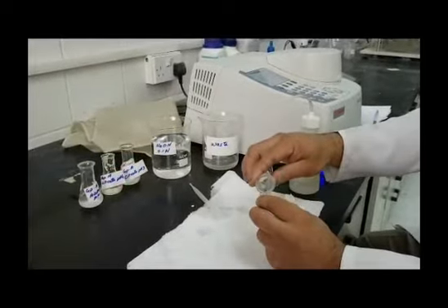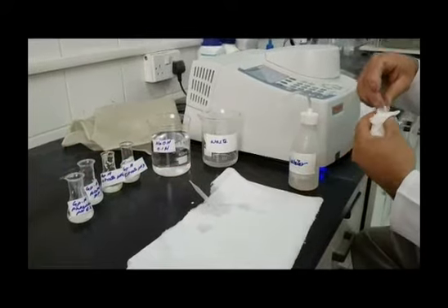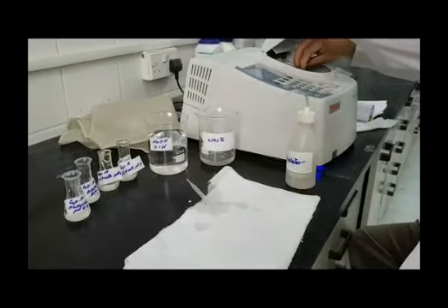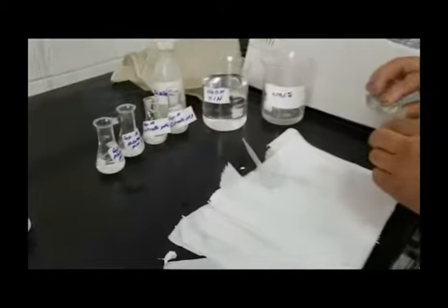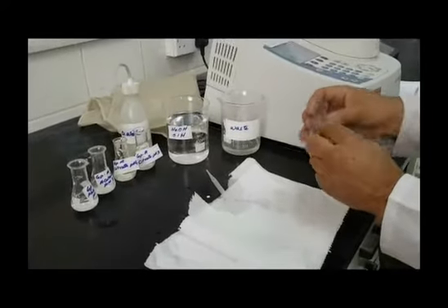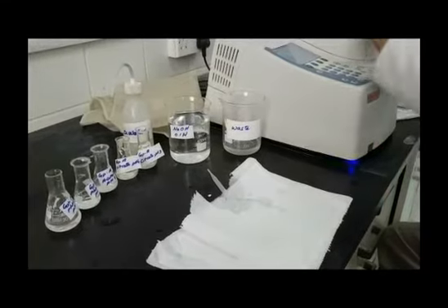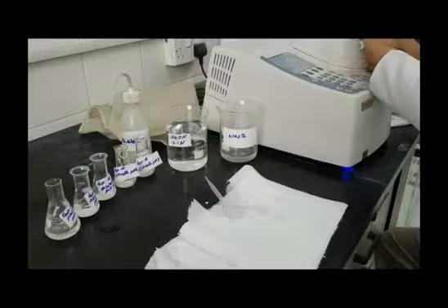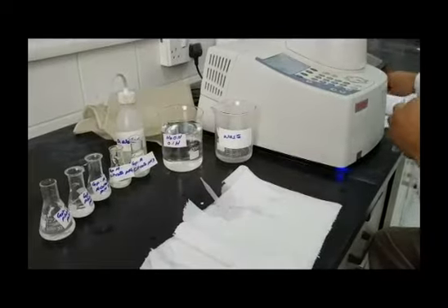Do further dilutions using sodium hydroxide, the used molar concentration, whenever you need to do so. When do we need to do further dilutions? When we get absorbances higher than the linear range, which is in our case 1.2. Absorbance values higher than 1.2.